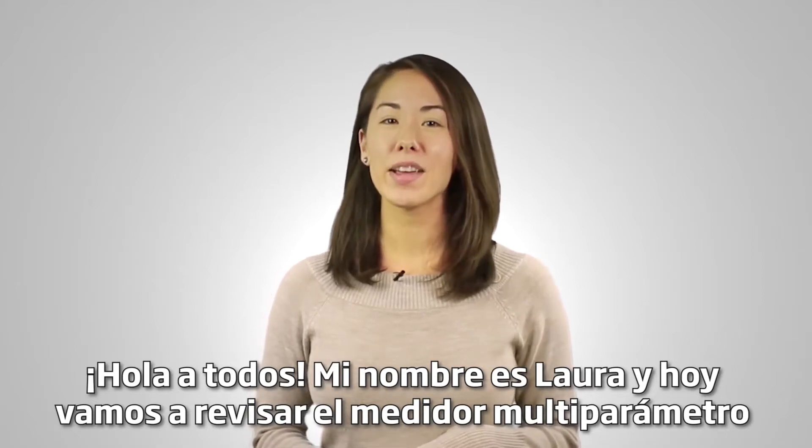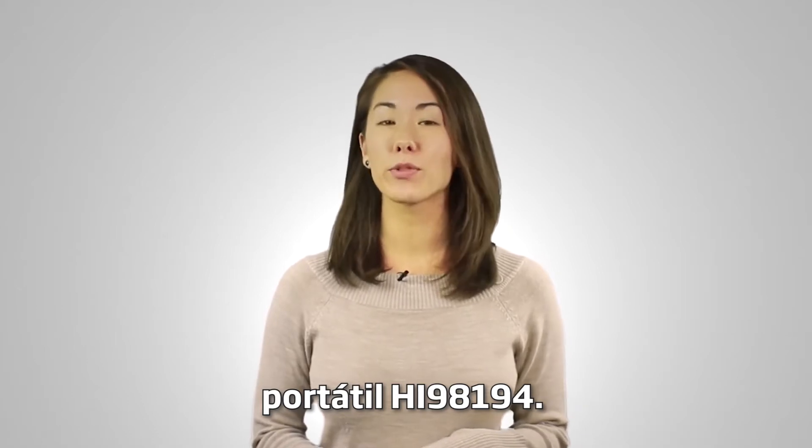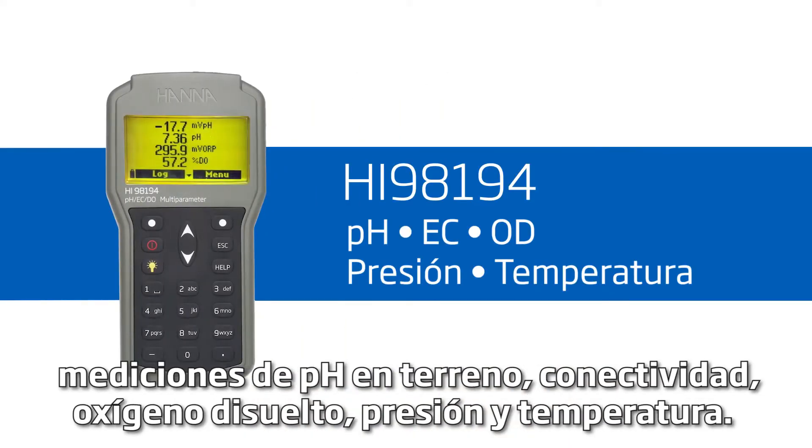Hi everyone, my name is Laura and today we're going to be going over the HI-98194 portable multi-parameter meter. This meter is ideal for people who need a durable solution to field measurements of pH, conductivity, dissolved oxygen, pressure, and temperature.